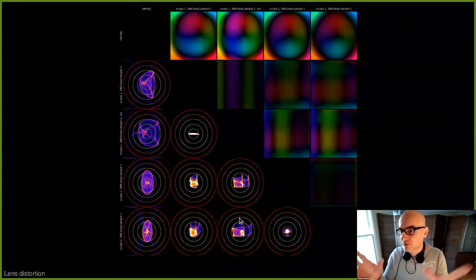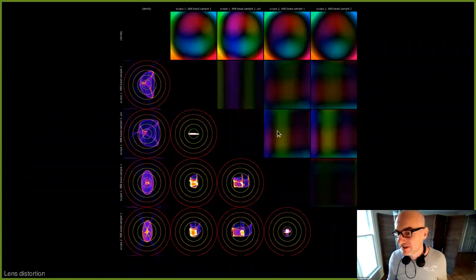And this is also wider spread. So it's not just the periphery of images, but we can see that there are differences here in the center. And weirdly, they're also kind of orthogonal and planar. The only explanation that I have for this that would make sense in my eyes is that the optical system, these microscopes, does not only consist of lenses, but there are also mirrors involved, and they may just introduce these XY artifacts. But probably somebody of you has a better idea.